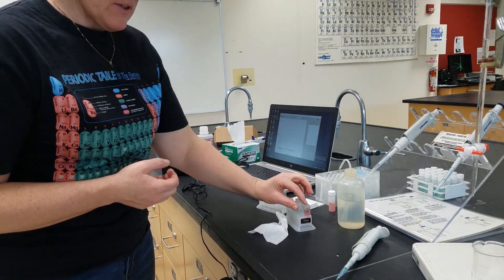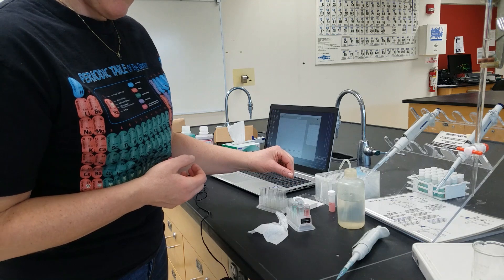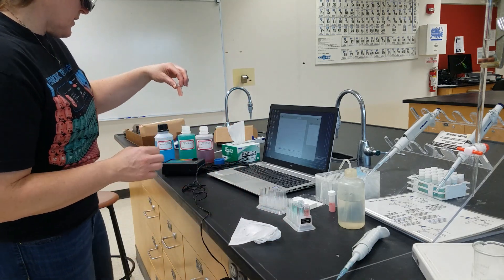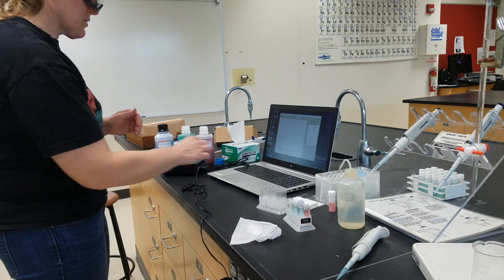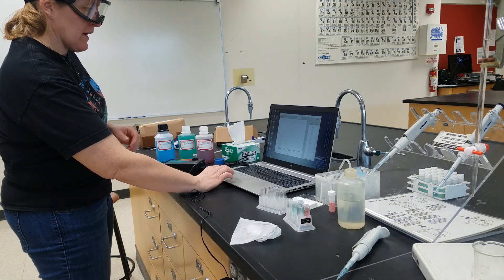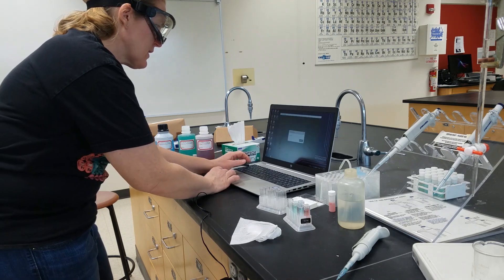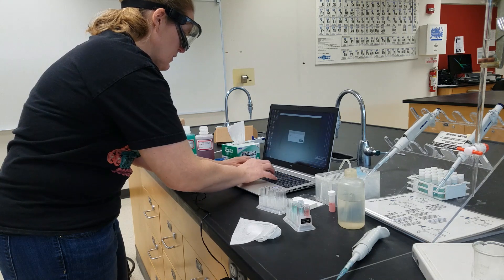Now I'm going to start by collecting the spectrum for the cobalt nitrate. We're going to clean it to make sure there are no fingerprints. We put it in so the clear portions of the window are facing the light, and we click collect. Once it has collected for a few seconds, we hit stop. And we can rename this data set as cobalt nitrate.